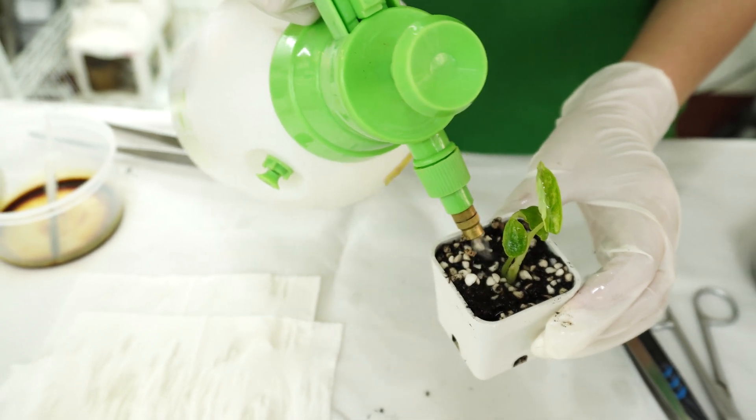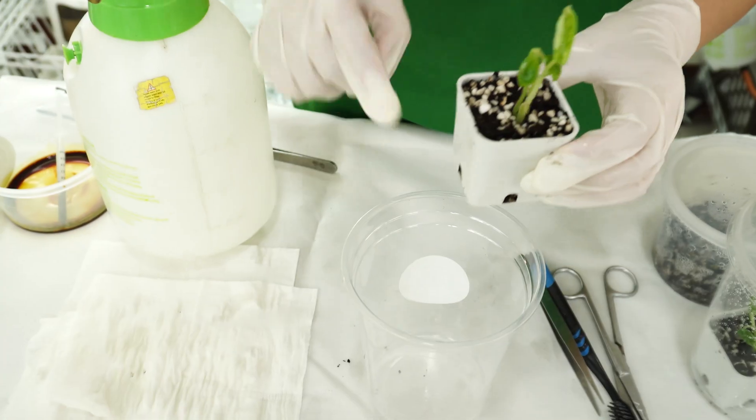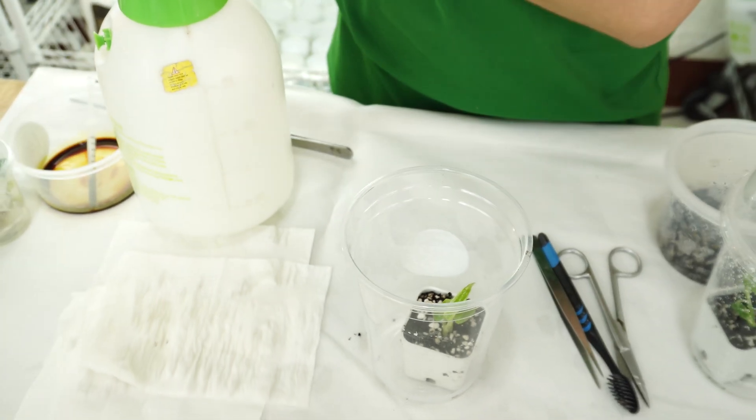Just give it this much water, then put it inside our dome plastic container or dome plastic cup and cover the lid.